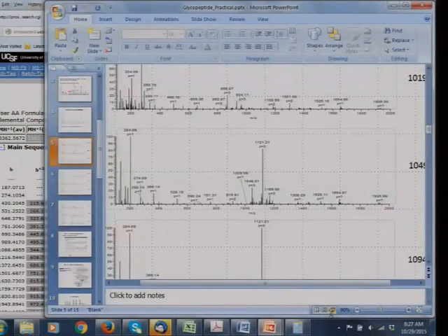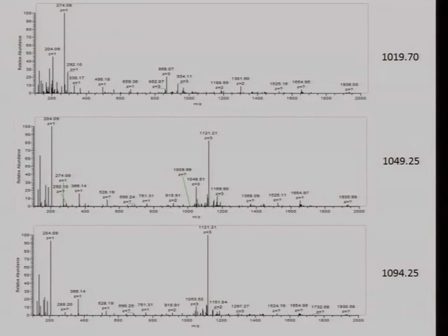Sorry to interrupt, but I can't understand what you are doing now. Okay, so no, that's fine. This part. Yeah. So we've decided that this particular peptide is a differently glycosylated version of the other one that we've already identified. And so what I'm trying to work out is what is the mass of the glycan on here, because we know what the mass of the peptide component is because we've got the peptide sequence. And so I'm trying to work out what the difference in mass is between this peak that I've seen and the mass of the peptide on its own.